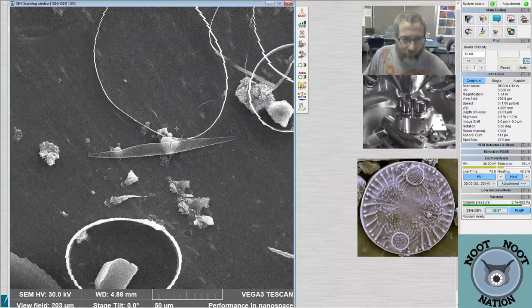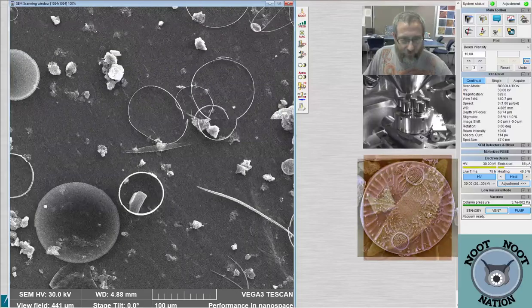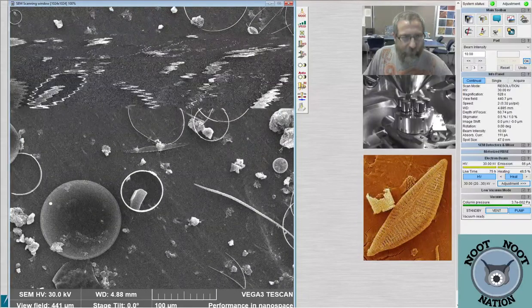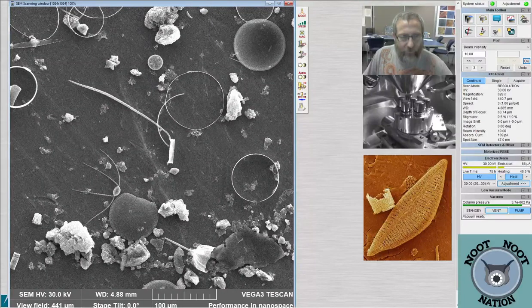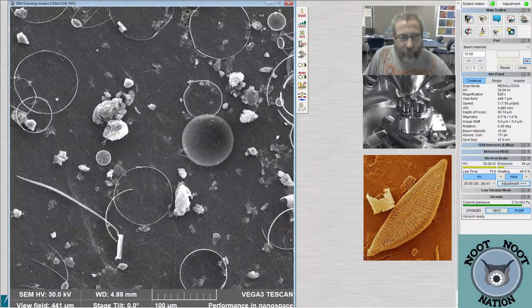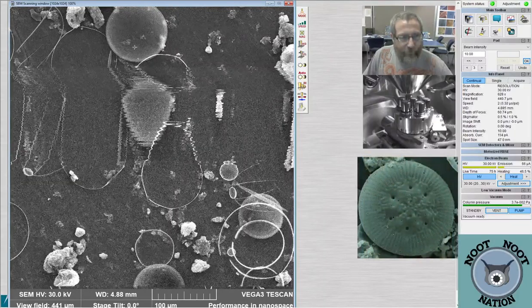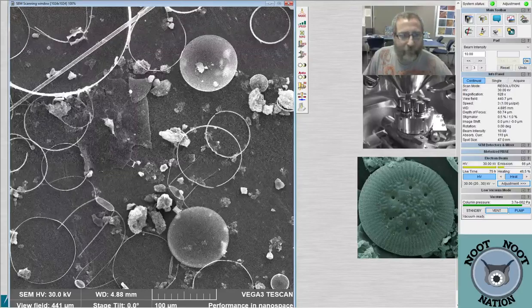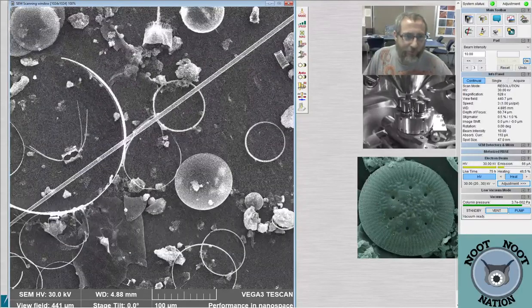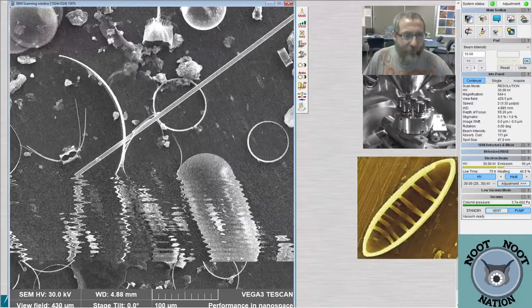It'd be neat to see, because the way they move themselves along in these long rows, they have their overlapping ends, but they slide. Yeah, it's confusing to me even when I look at them how they're sliding, but I know they're using their raphe. Oh, look, it's our giant one, and cut a piece of it again.